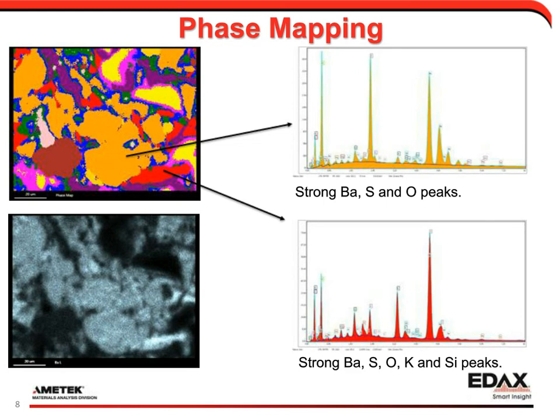And we also see some potassium and silicon in here that wasn't present to the same degree in the gold-colored phase. So the phase map goes in and compares these two spectra and assigns them different colors based on not just the presence of elements, but also how much of it is present there, but still without going in and doing a full quantification. It is simply a spectral comparison routine.